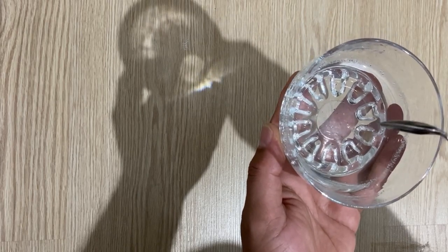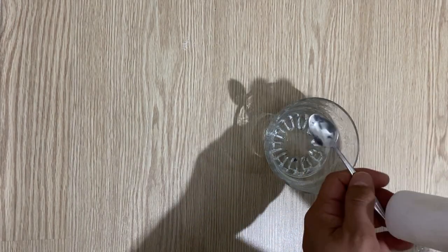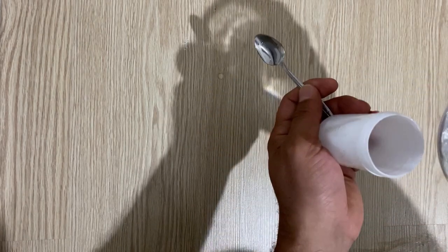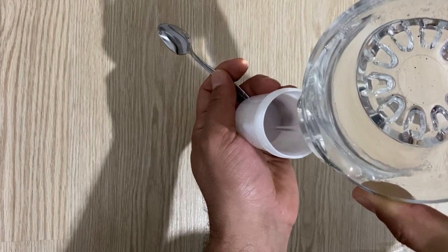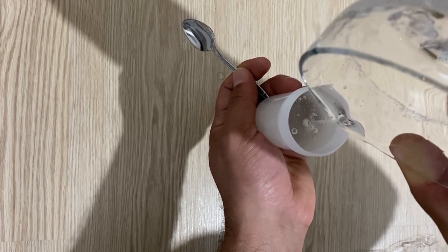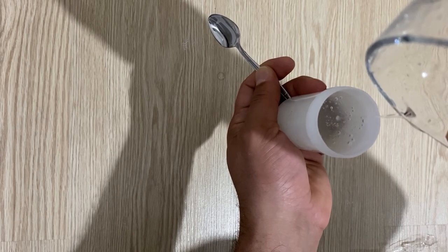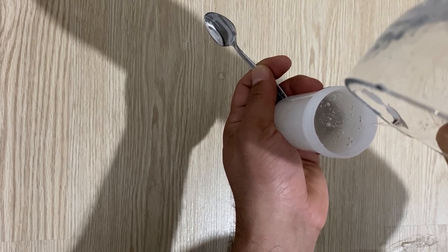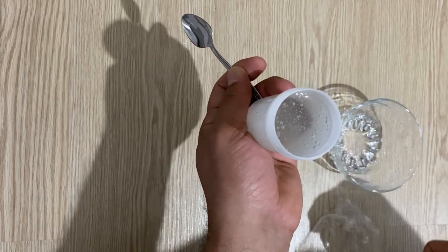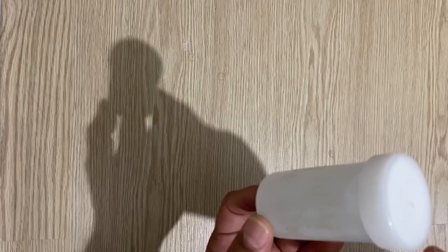Now I'm going to put this polyvinyl alcohol solution into a plastic container and put it away for whenever I want to use it. Just like this plastic container — I will pour the polyvinyl alcohol inside it and close it. Okay, it's done.